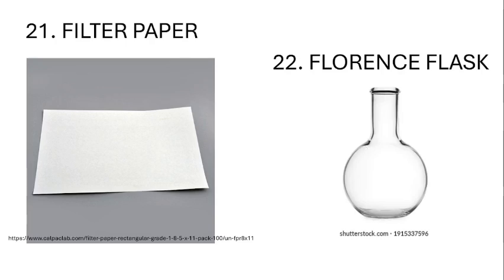It is used for boiling liquids, and it is also used for sublimation in one of our experiments. In sublimation, from gas, solids will form and adhere to the bottom surface of the flask.